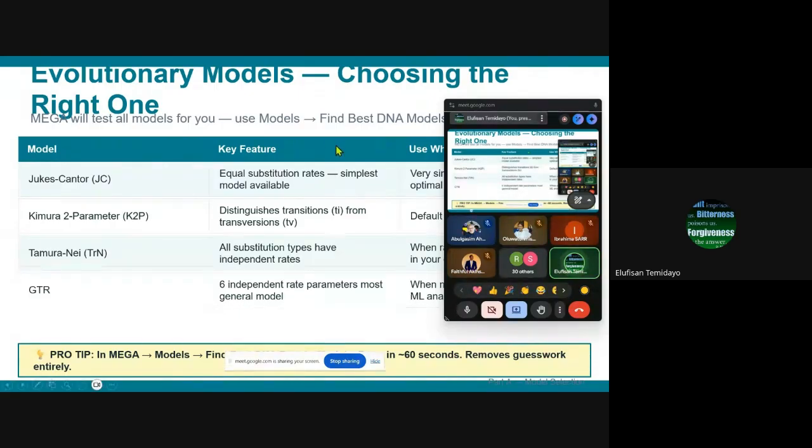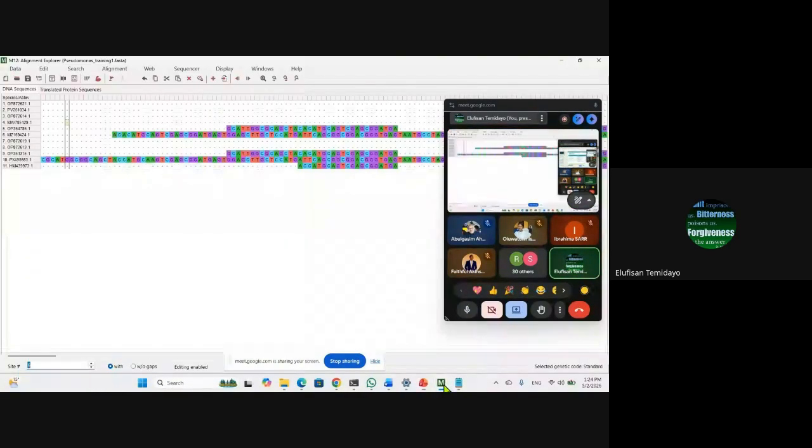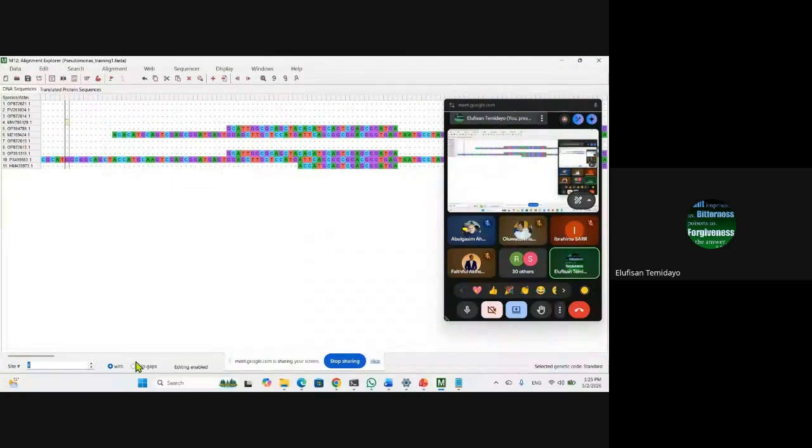I'm going back to my MEGA now. Let me do this. I'm going to show you something there on MEGA. Let me see if I can find that. I want to show something on MEGA. Oh, sorry. Okay, let's continue with this. I can show that later. So now I have this.